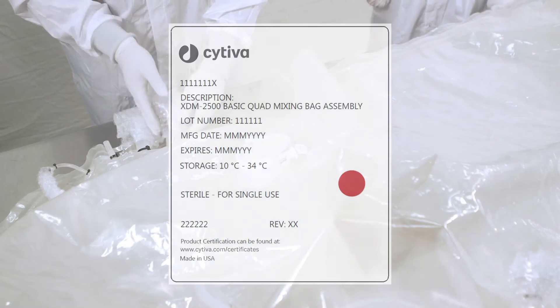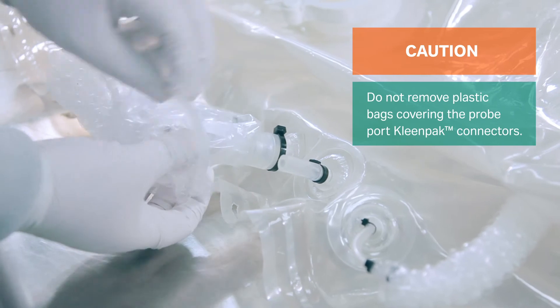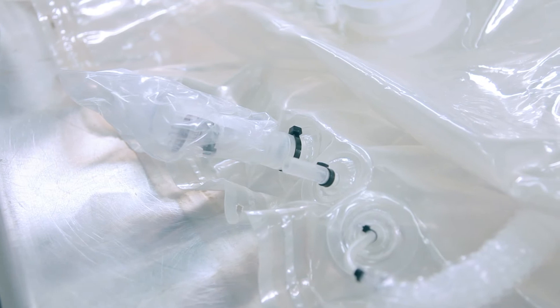If your bag has probe ports, remove the bubble wrap. At this point, do not remove plastic bags covering the probe port clean pack connectors, as this can damage the equipment.